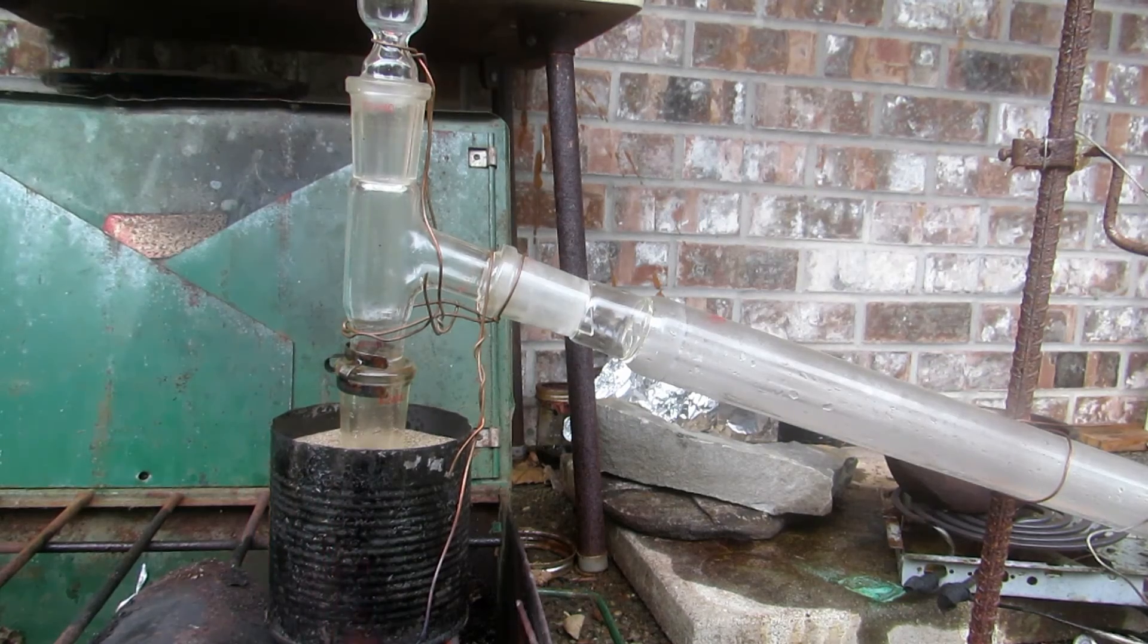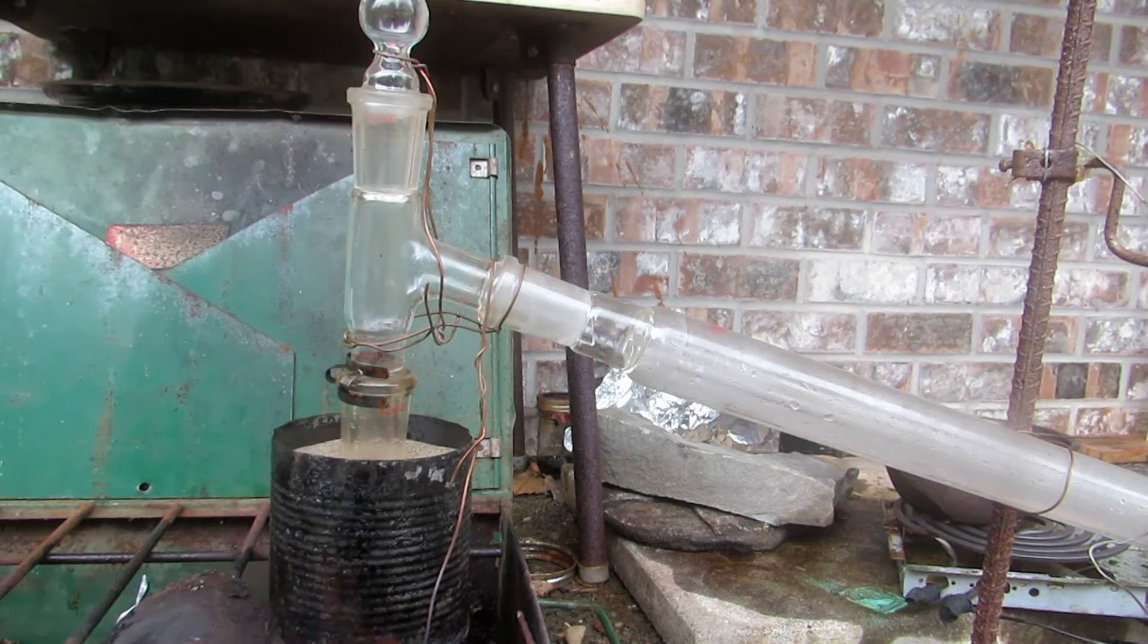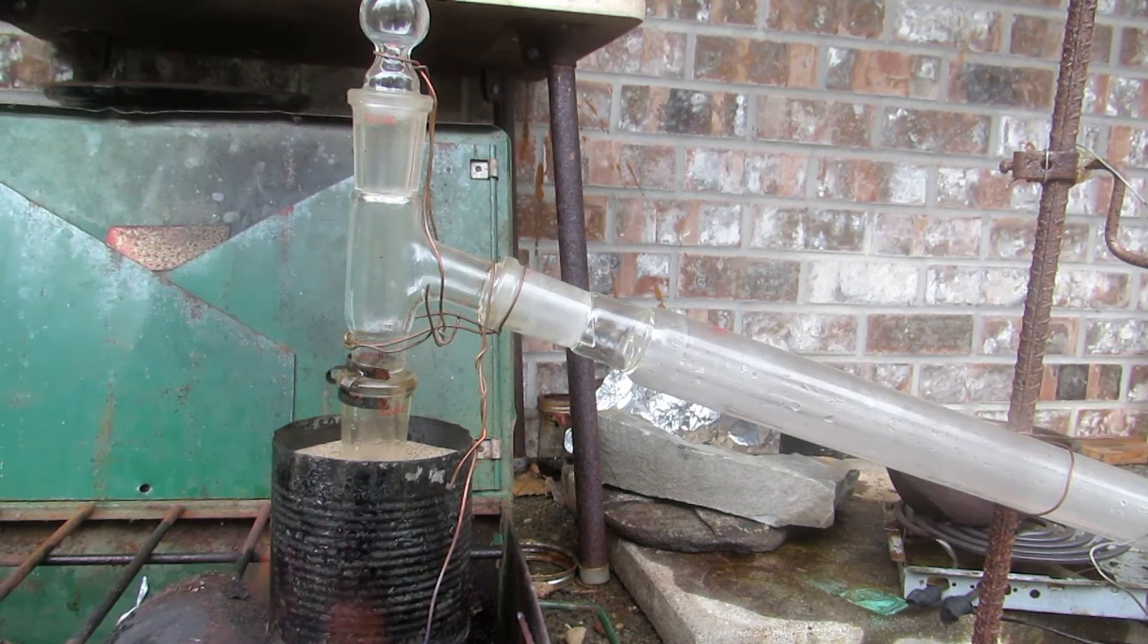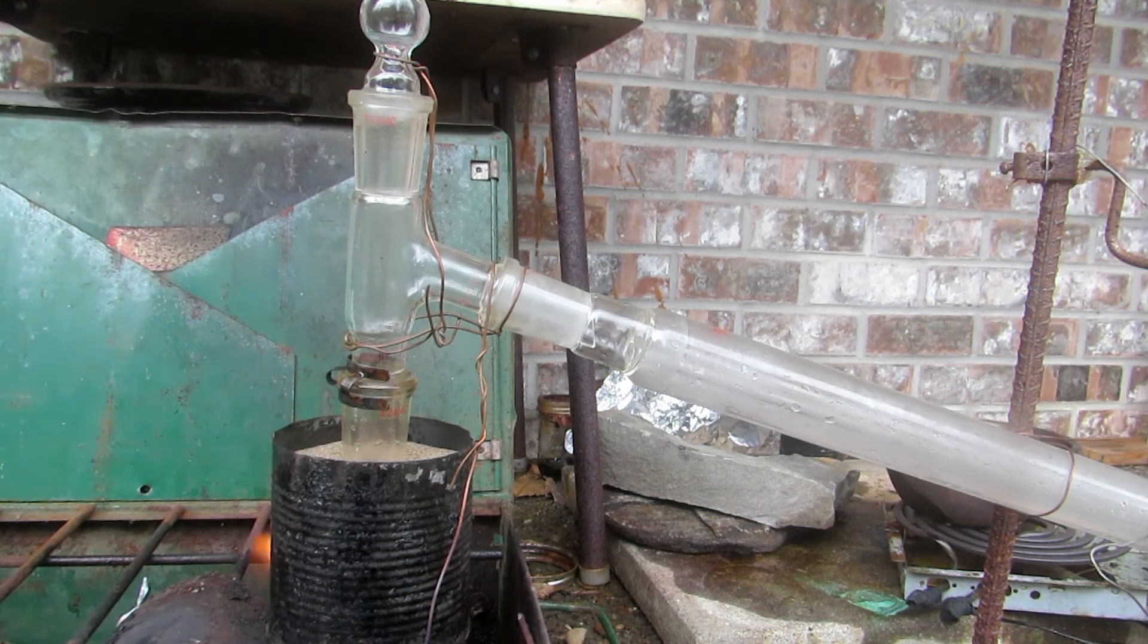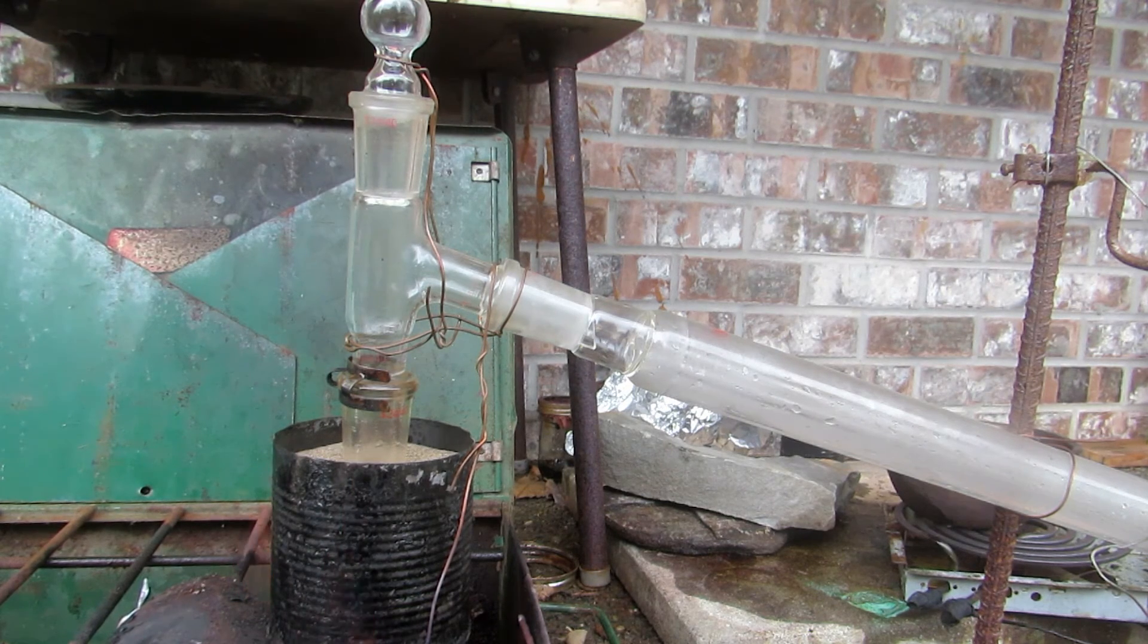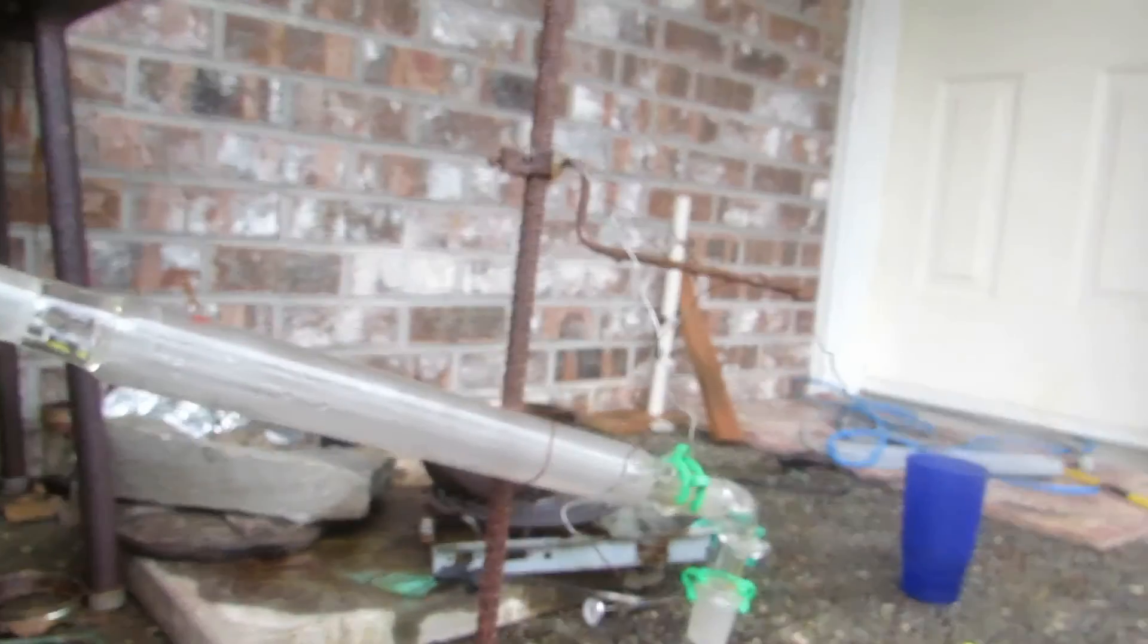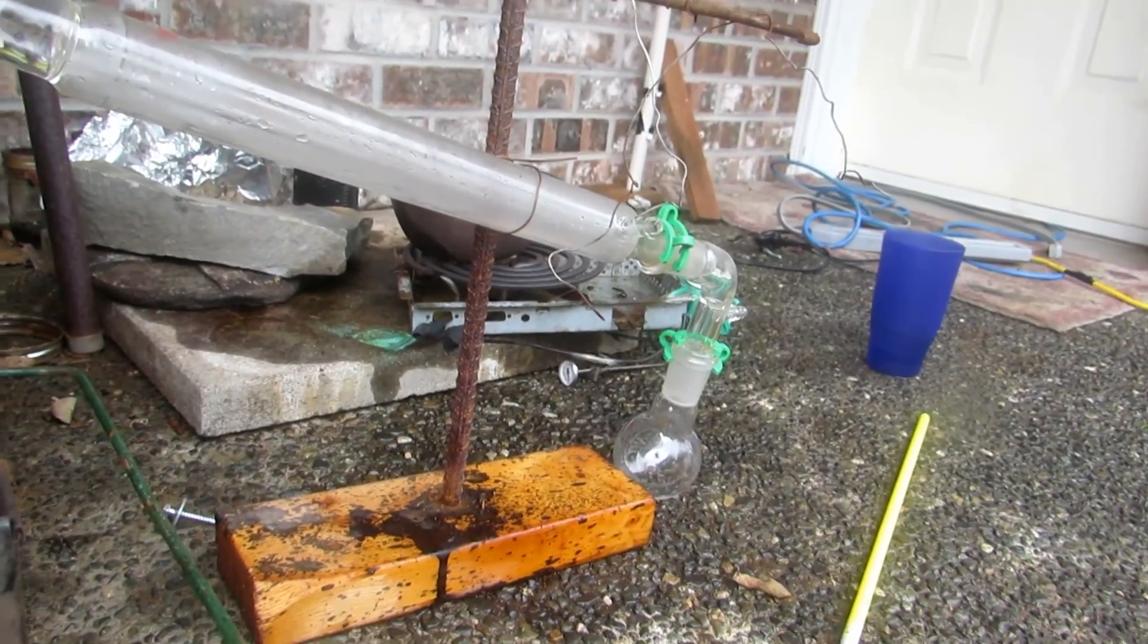I couldn't find all my Keck clamps, so I wired the rest of the apparatus together with copper wire. I greased the joints with sulfuric acid because it has a high boiling point and should handle the high temperatures that the methyl salicylate will distill at. At the cooler end, I just used Keck clips.